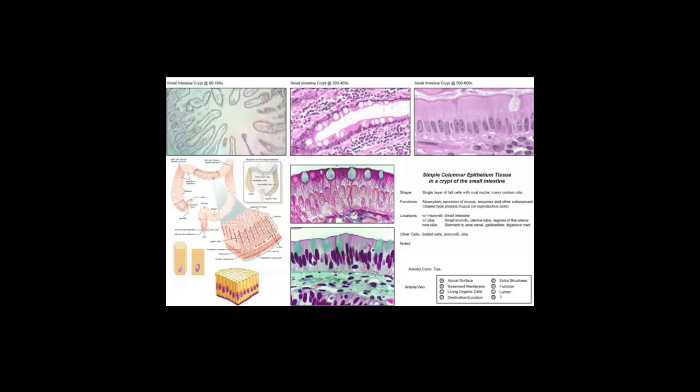And then we would have a number of different types of cells throughout the areolar tissue that it's bound to. You can see different numbers of goblet cells associated on those apical surfaces, producing mucus to decrease surface tension as you move through the digestive tract and the tubing that's carrying the waste. And as this occurs, you're going to see a decrease in the moisture level of that feces that's being produced. And as you move it through, especially the large intestine, goblet cell number would have to increase.